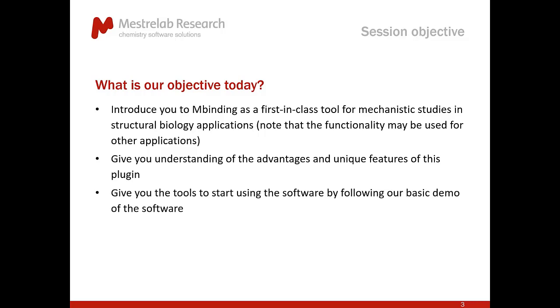This is what we have targeted with this specific plugin, but a lot of the functionality that you will see today may also be used in other contexts where, for example, you need to handle a significant number of 2D data, and you have an interest in following the evolution of peak positions, etc. So, you can look at it as the objective that we developed it for, but you may also be able to find application in other fields.